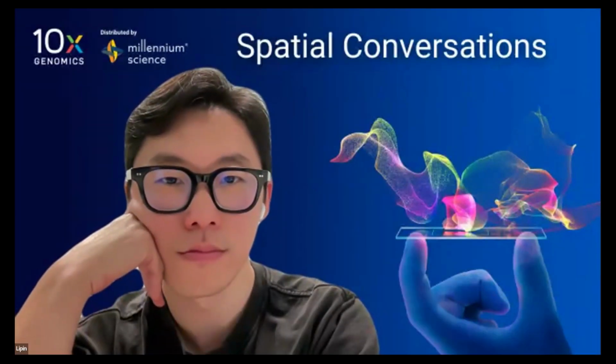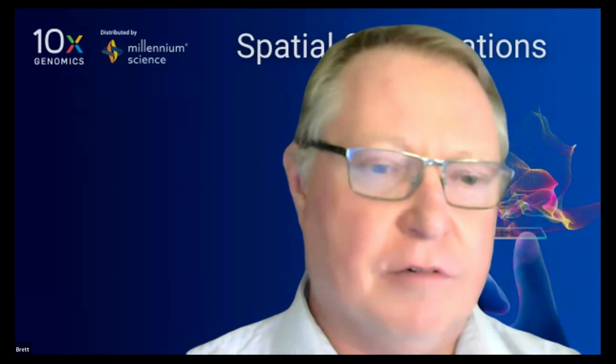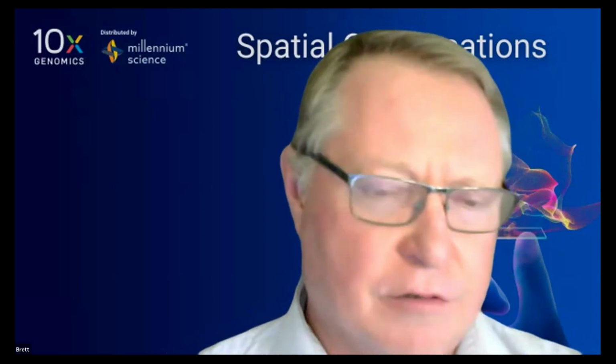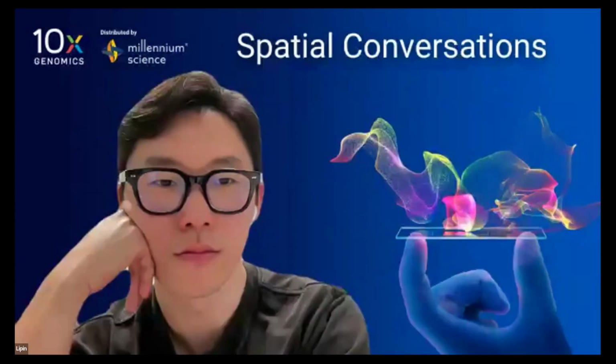I think the data analysis is a little simpler with Xenium. Segmentation is certainly more advanced with Xenium than with Visium HD. Obviously, HD is new, and it is a grid-based detection format. We have recommendations on how to approach that, but I think they're more advanced with Xenium.